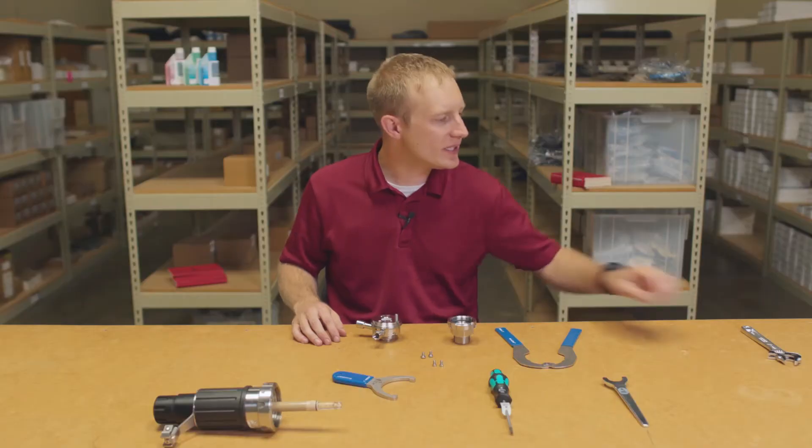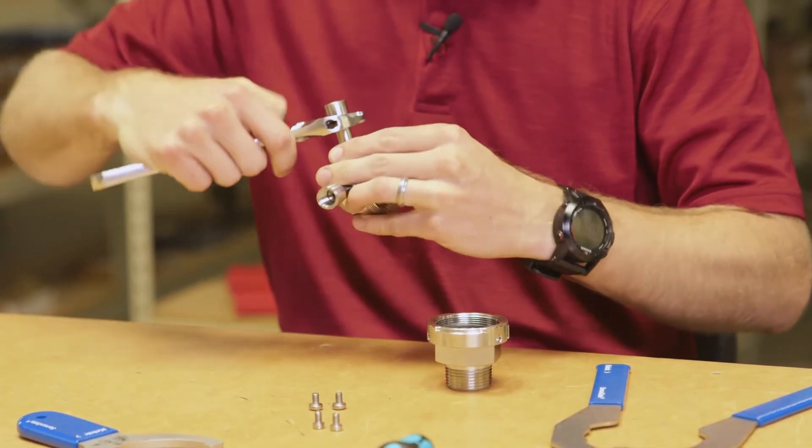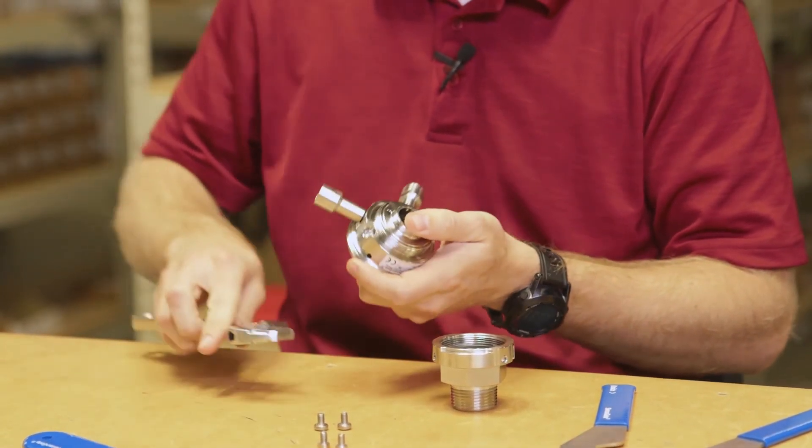Finally, using an adjustable wrench, we'll loosen and remove both the inlet and outlet fittings from our cleaning and calibration chamber.